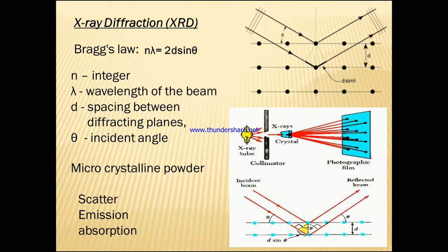When this occurs, one of the electrons from the inner shell goes outside, so electrons migrate from the outer shell, that is N to M, M to L or L to K. The electrons move from the outer to the inner shell to fill the gap.